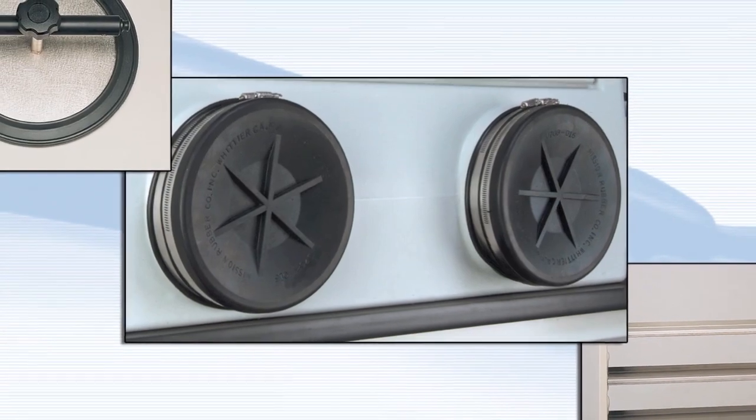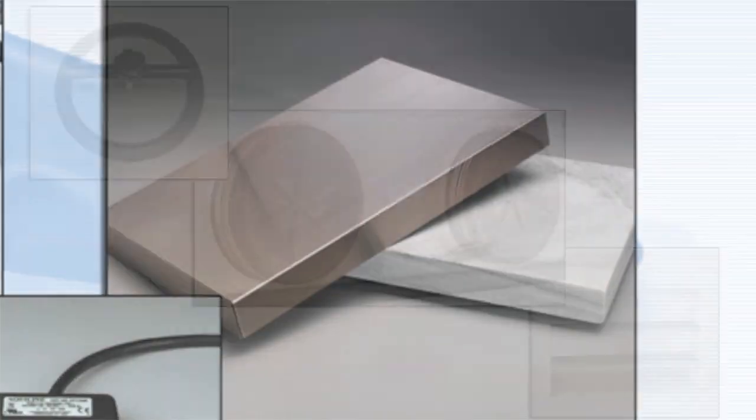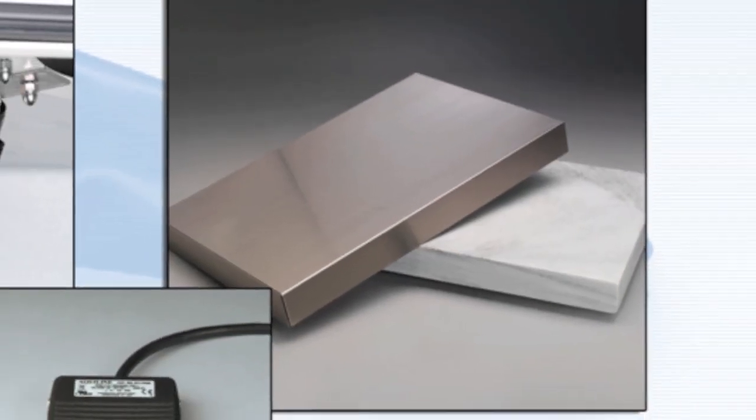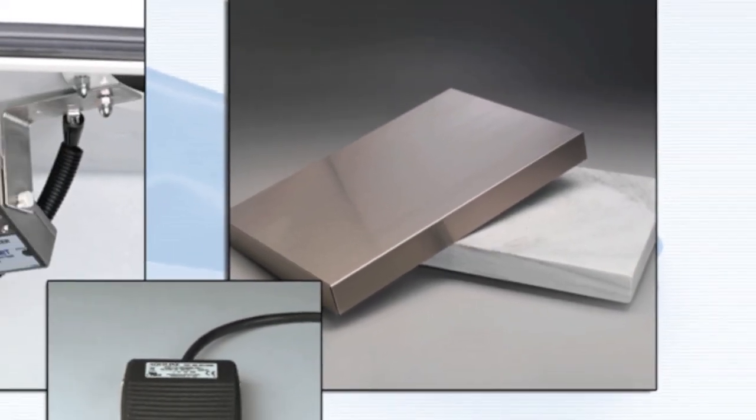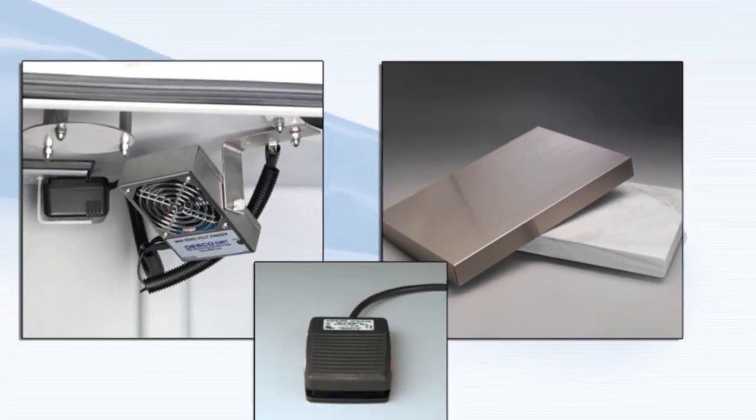Many accessories are available to customize the protector glove boxes to fit individual applications. For weighing operations, an anti-static fan, a balanced vibration isolator, and a remote blower foot switch controller are available.